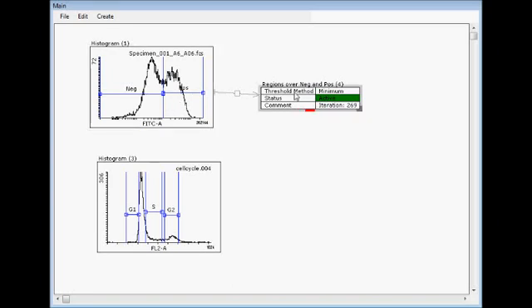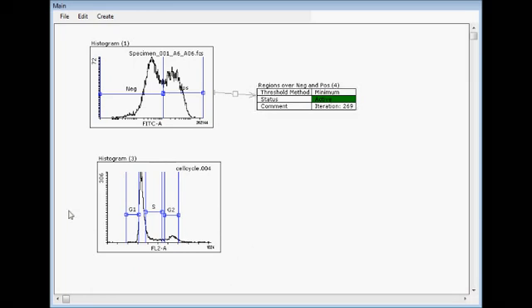This is not super intelligent and not perfect, but at least it helps you to automate your analysis, and maybe then you can check later and correct those, maybe rare, cases where this algorithm has failed. But anyway, if you have hundreds or even thousands of samples, this is hopefully a very big aid for your analysis. A similar situation might be in cell cycle analysis, where sometimes staining intensity changes and the peaks are in a little bit different places.